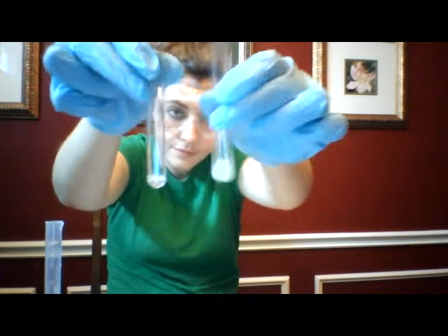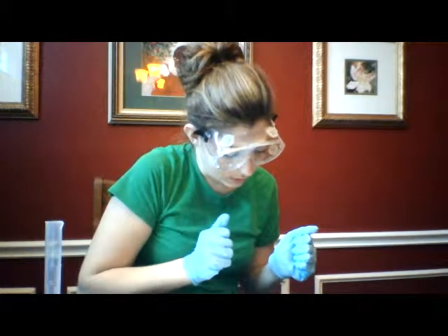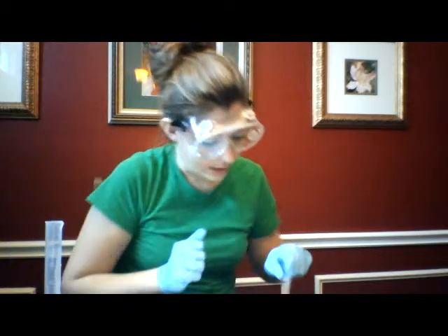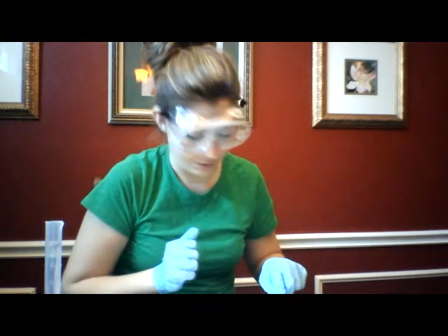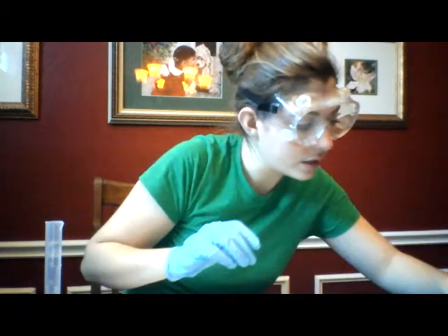Okay, now we're going to acidify the test tube by adding nitric acid. Let's see, where did I put it? Here's nitric acid. And we're only going to add a few drops. This is still in test tube 2.